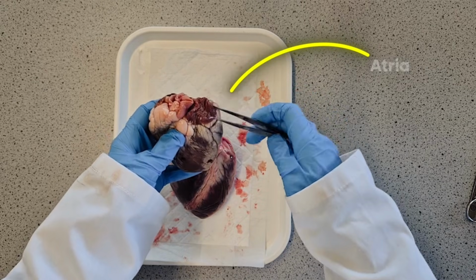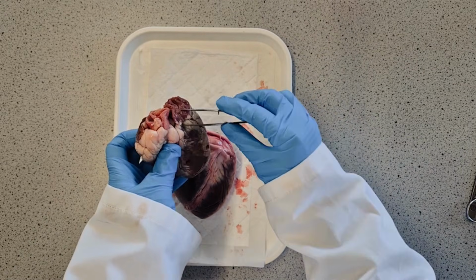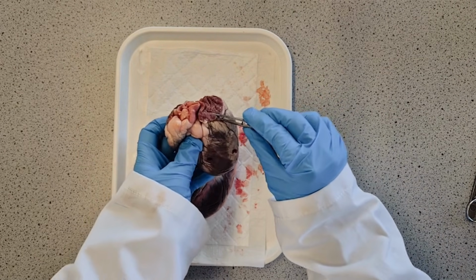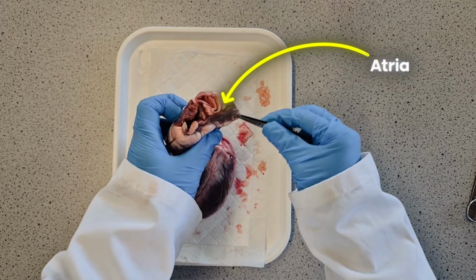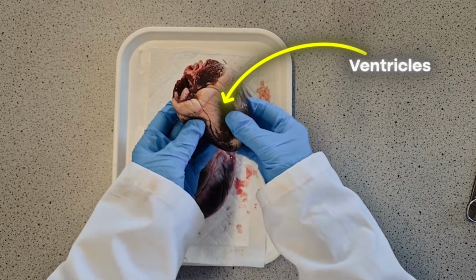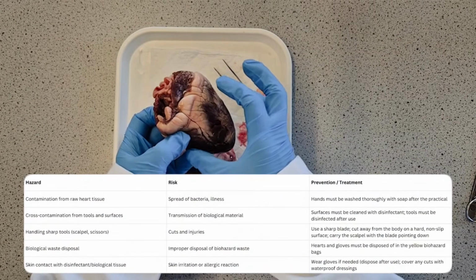You can actually see the atria, which are these small chambers at the top. So small that often students don't realise that those are the atria themselves. So it's worth pointing that out to the students. We've got one at the top here, we've got our left and right, we've got the other one here. So those are the atria. The ventricles are the chambers here, and when we cut into those, we'll be able to see the thickness of the cardiac wall of the chambers of the ventricles.